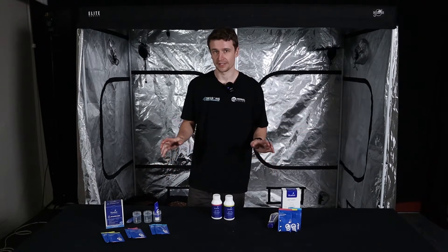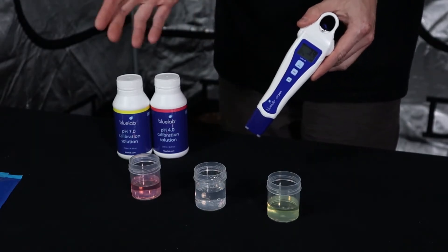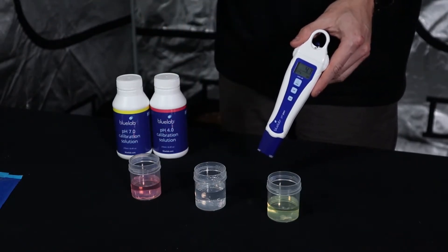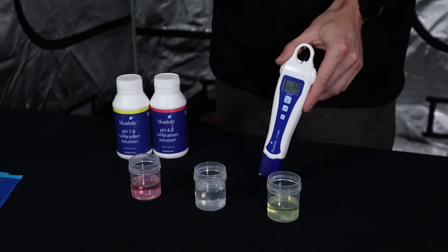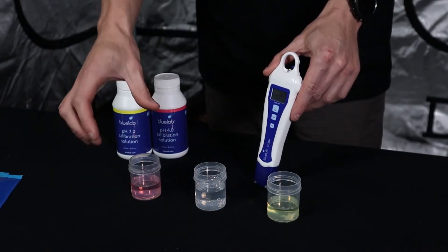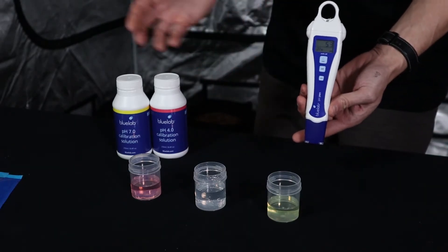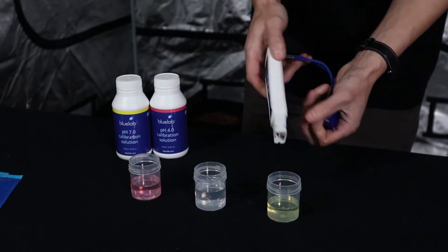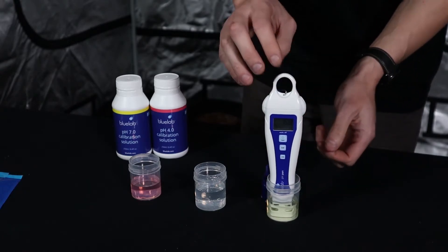Now let's get into actually calibrating the pen. We have a fresh PH pen that hasn't been calibrated or exposed to any nutrient or water. I've taken the three cups from the care kit and poured out some solution — PH4, PH7, and tap water for rinsing. If you're using sachets, we recommend getting a coffee mug, tearing the sachet open, and resting the pen on top of the sachet rather than pouring it out.